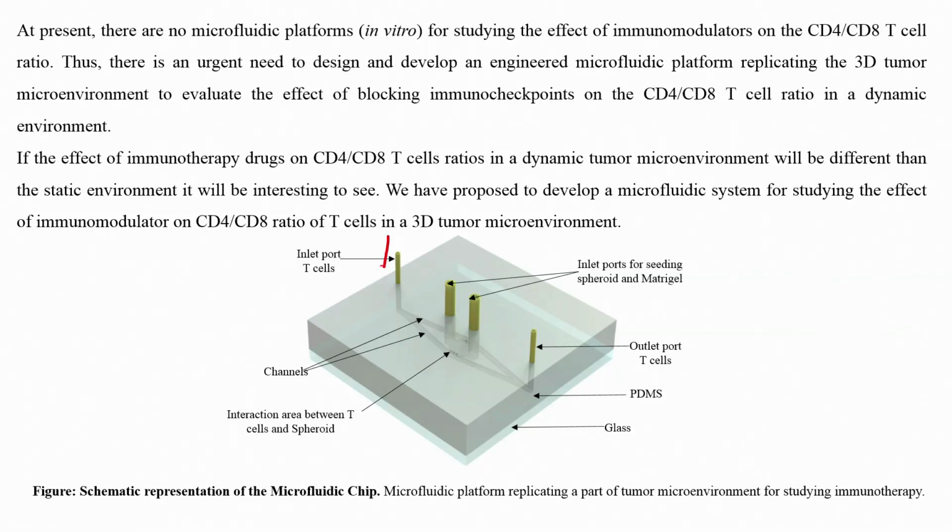There is an inlet port, right. You can see there is a microfluidic chip that goes here and merges here, this goes all the way, it merges here, this is the outlet, this is the inlet. In here there is a circle where you can load the cancer spheroid.